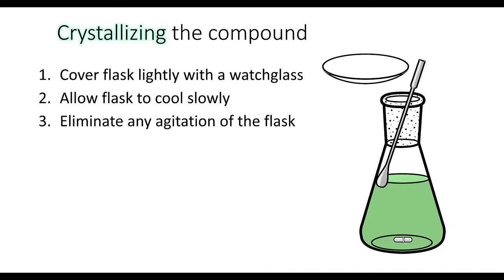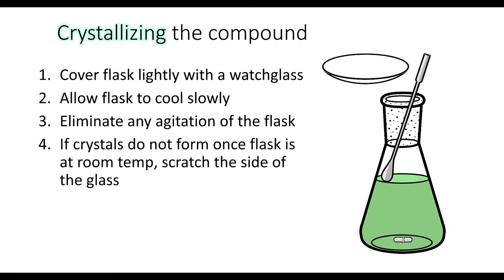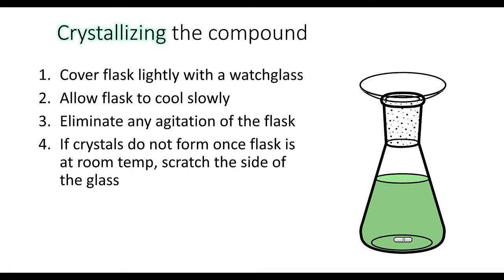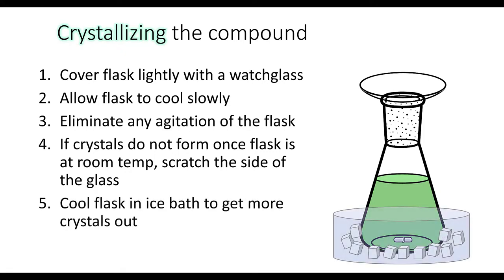Once the flask reaches room temperature, if there are still no crystals anywhere in the flask, we can use this trick of taking a spatula and scraping the side of the flask a little bit. This releases a few micro-crystals of silica from the flask and they can serve as seed crystals for our crystallization — on these tiny glass particle surfaces, the crystal can start to grow its lattice. If we want more crystals to come out of solution, we can cool the flask in an ice bath.